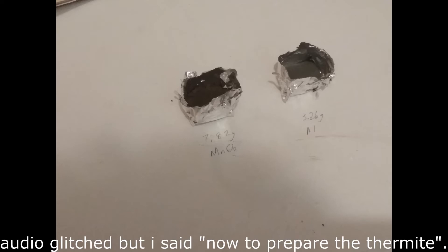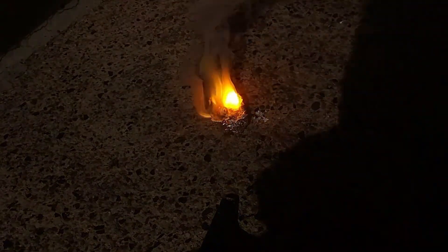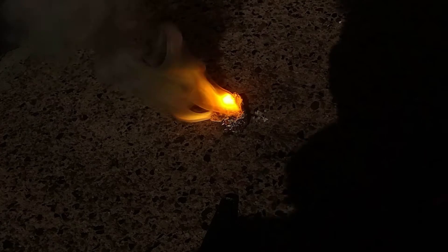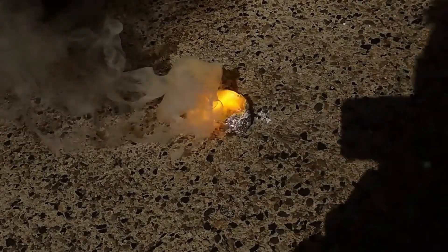To prepare the thermite, we just add aluminium powder to manganese dioxide in a 5 to 12 mass ratio. We simply ignite the mixture by burning a piece of magnesium ribbon, and this reaction is extremely exothermic and produces a lot of smoke. So work outside and wear eye and respiratory protection.